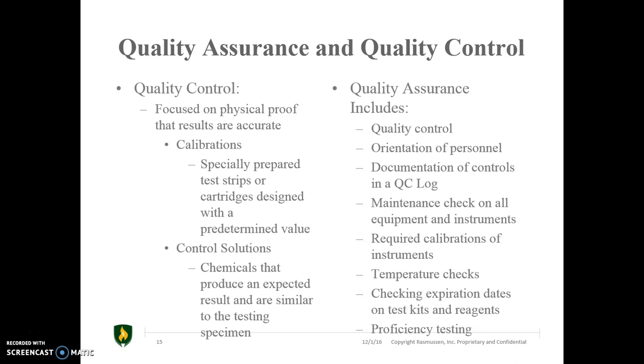Quality assurance will include quality control, orientation, documentation of controls, maintenance checks, required calibrations, temperature checks, checking expiration dates, and proficiency testing. Quality assurance also develops what we call reference values or normal values.